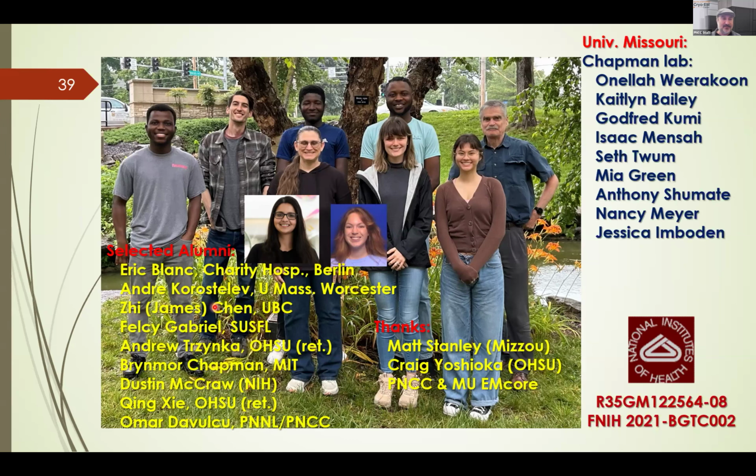You've looked at a number of different serotypes of receptors and their complexes. Is there a pattern that emerges as to what type of map is the best to refine into, whether that's sharpened or unsharpened or enhanced in some way? What is your favorite? Yes, we're usually using sharpened.